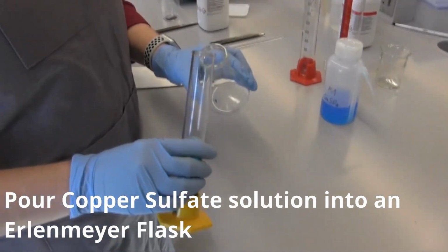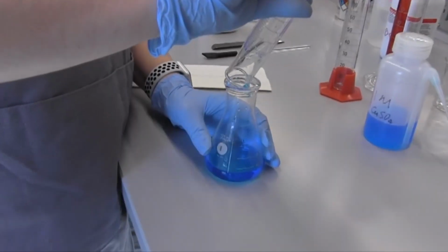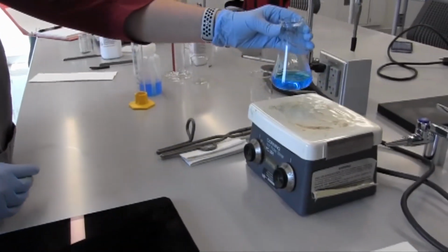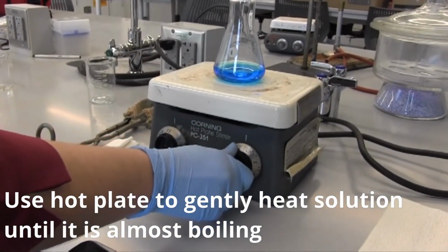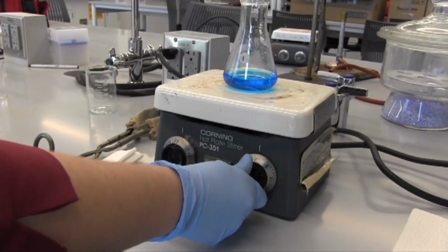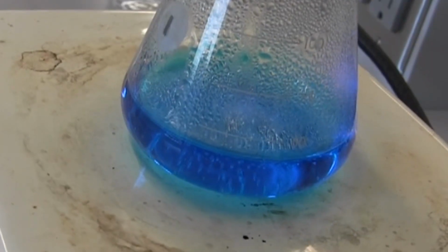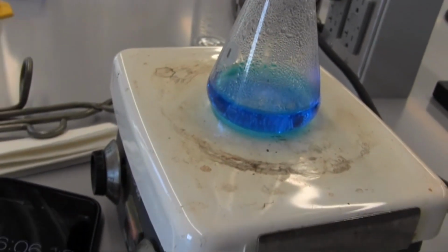Pour the 1 molar copper sulfate solution into an Erlenmeyer flask and place it on a hot plate. Turn on the hot plate and heat the copper solution gently until almost boiling. We can observe that the copper solution is almost boiling when there are small bubbles forming at the bottom of the solution and condensation forming on the sides of the Erlenmeyer flask.